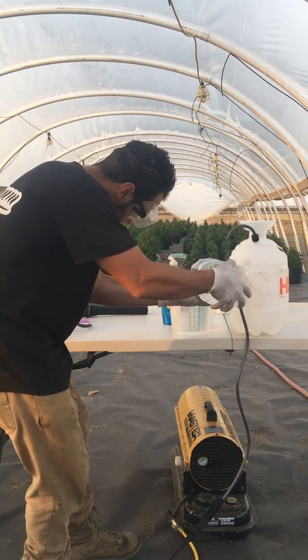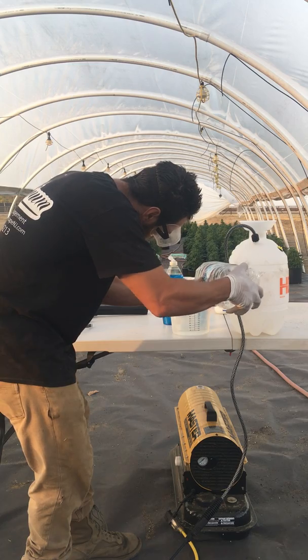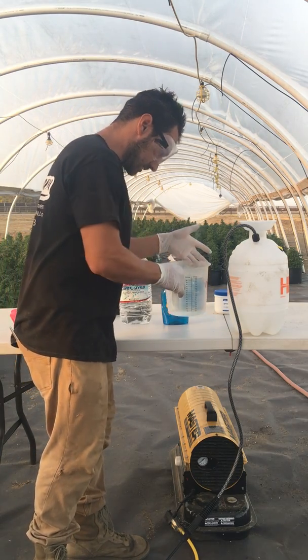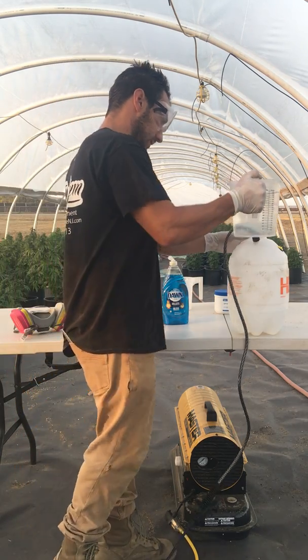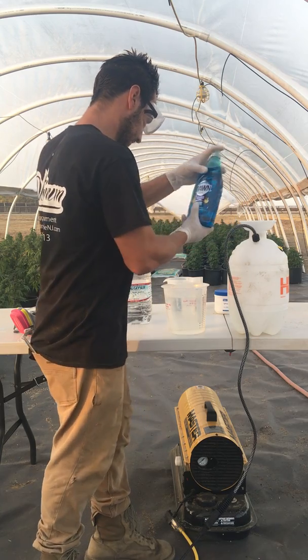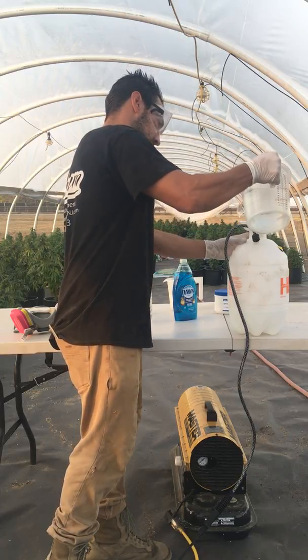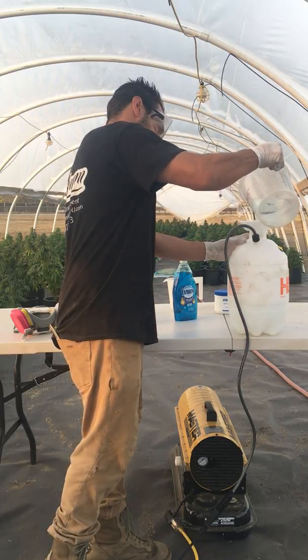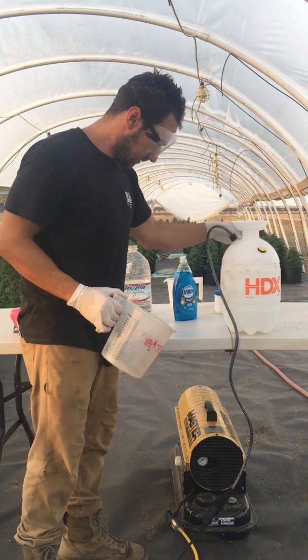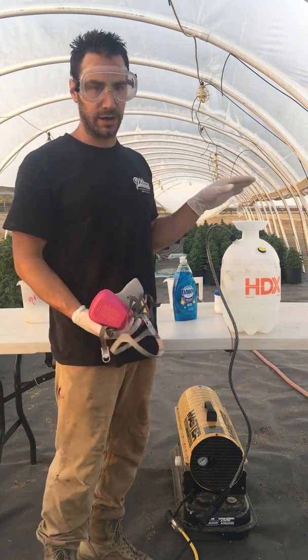I'm going to fill this to 2,000 milliliters — 1,000 of each of the two solutions — then add 2,000 milliliters of purified water. I'll put 6 to 12 drops of soap in here first as a surfactant. So I now have 4,000 milliliters inside here, which is enough to do this whole entire greenhouse — close to 500 plants.